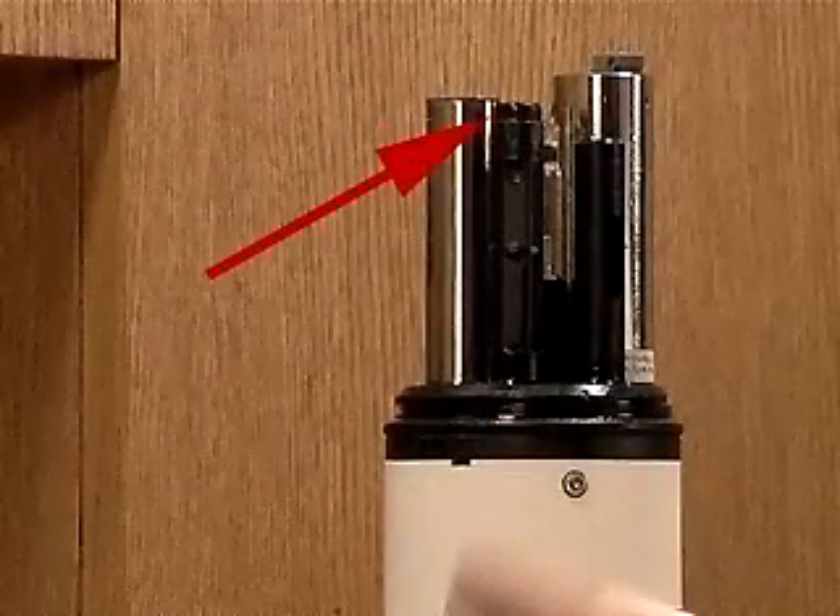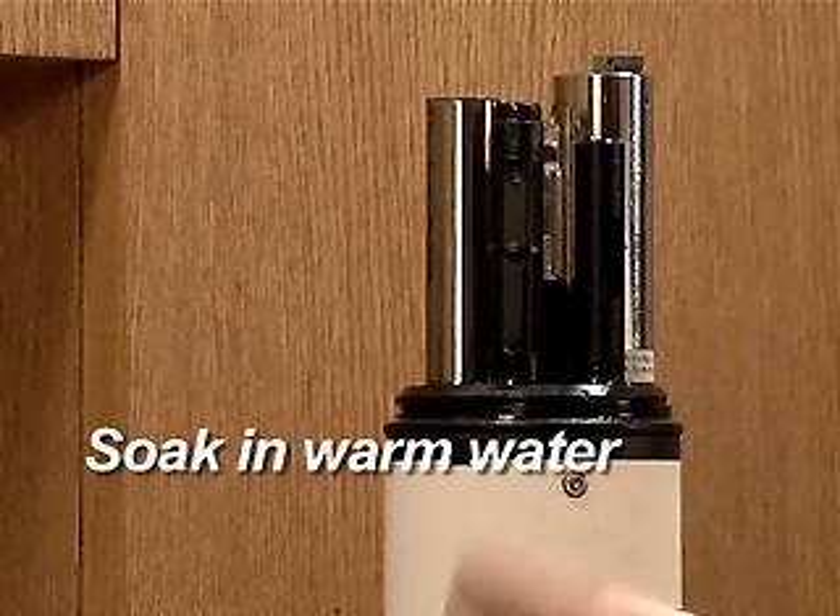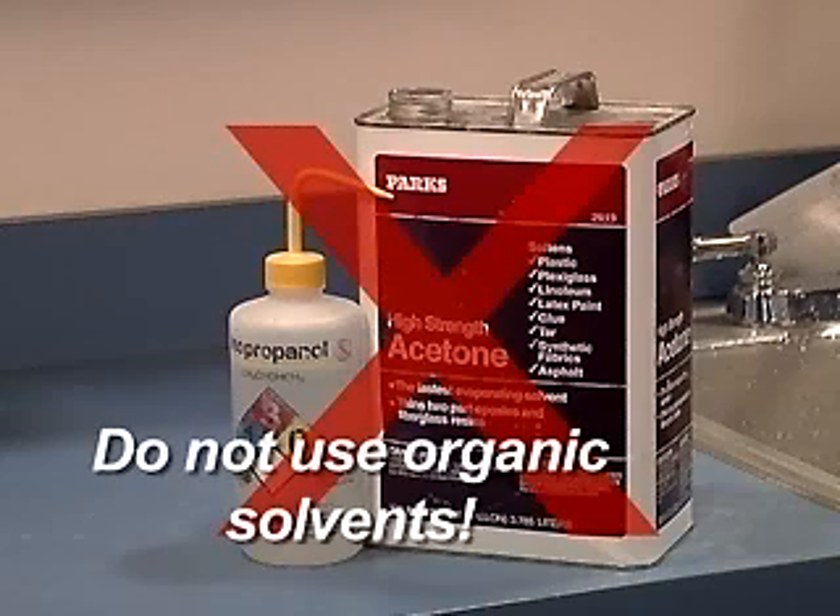Hard scrubbing will remove the black coating from the outside of the sensor cap. If more than half of the coating is removed, the cap must be replaced. If deposits on the sensor are difficult to remove, soak the sensor in warm fresh water until the deposits soften. Never use organic solvents such as acetone or methanol on any part of the sensor or cap.